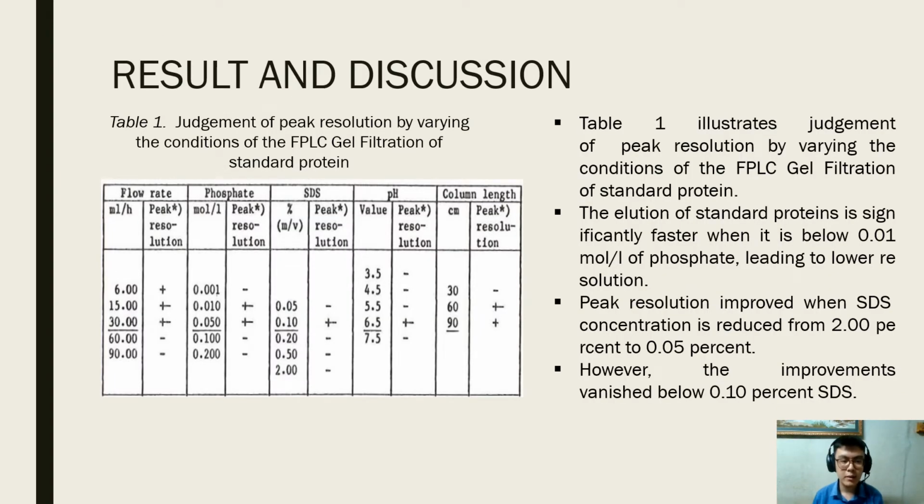Next, it is result and discussion. Table 1 illustrates judgment of peak resolution by varying the conditions of the FPLC gel filtration of standard protein.